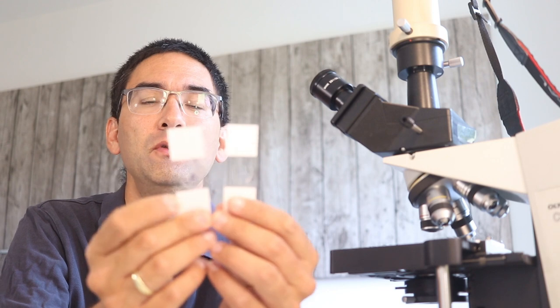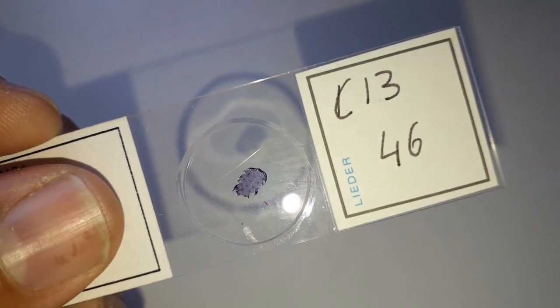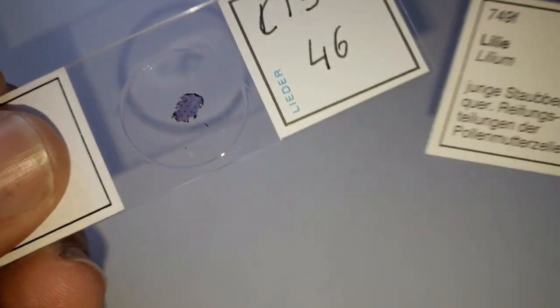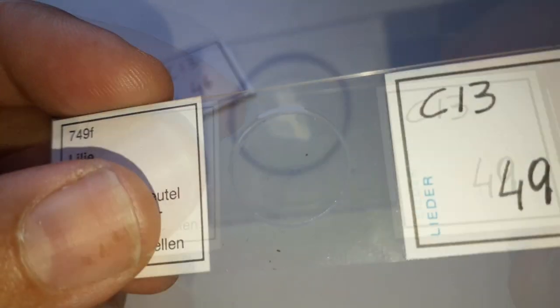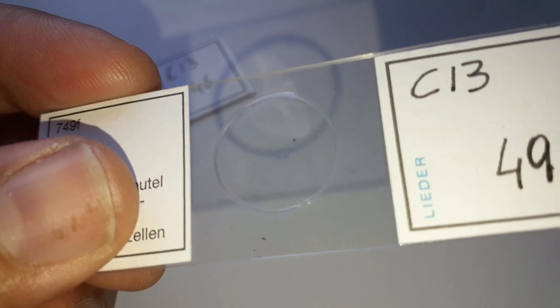Before we get started, for the first slide you want to look at, choose the right slide — otherwise it gets difficult. I want to show you two slides here. In one slide you can see the specimen quite well with your unaided eye. The second slide is very difficult to see. It's important that for your first slide you choose one where you can clearly see the specimen with your unaided eye. That makes life so much easier.